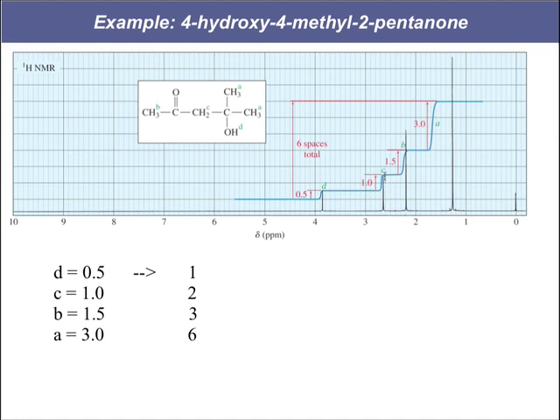It's kind of hard to tell in this area whether this is next to an oxygen or a halogen, or whether it's a shifted methyl ketone, which it actually is. Or if maybe it's an alcohol that's showing up between 2 and 5, and it's just on the lower end of that. There is some ambiguity, but at least we have a good sense of what those environments are likely to be.